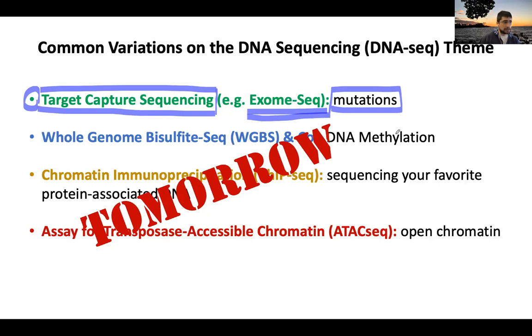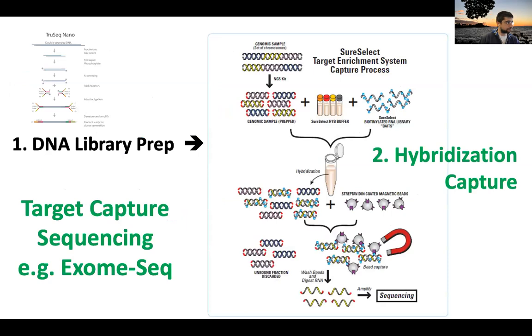Okay. The target sequencing capture, I think it's very useful because I want to introduce the UMI concept, the one that you saw in the Kahoot before. And it will give us the ability to talk about PCR duplicates a little bit more in detail, okay? So how does the target capture sequencing work, okay? The idea is I don't want to sequence the entire genome, okay? Because I'm interested only in a very limited region of my genome, okay? You don't want to spend too much money on sequencing something that you don't want to sequence.